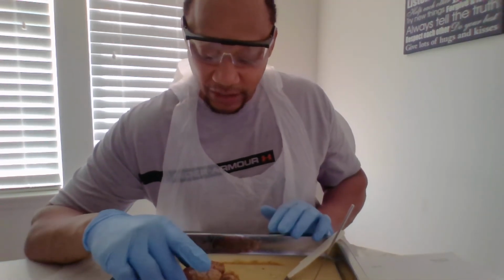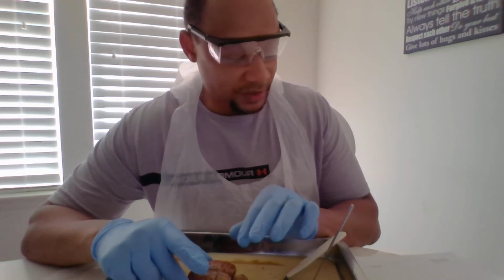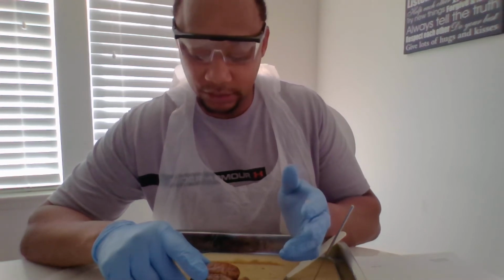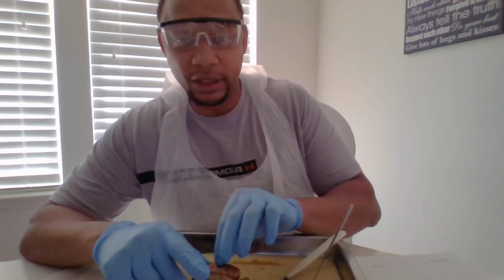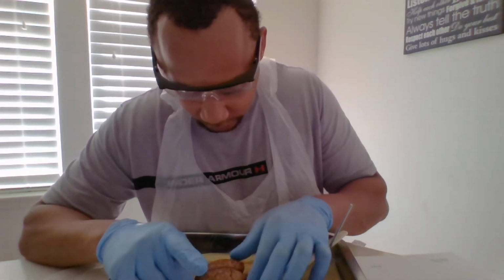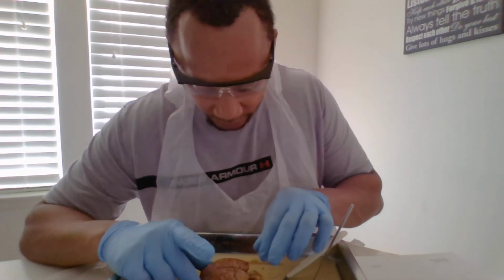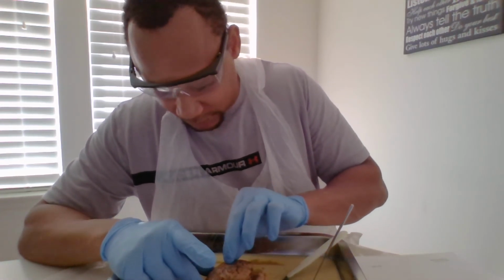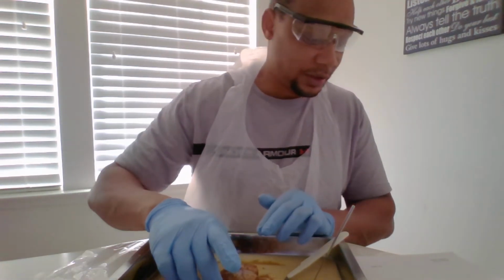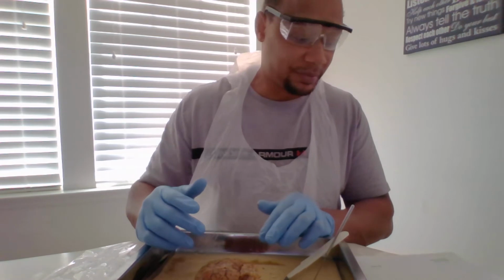Your meninges are actually right on top, and if you take off the arachnoid, it's like what comes from a spider. It's a shiny, webby type deal that's on top. Actually, some of mine came off. I've been trying to hurry up and do this because I had it a little bit too long, and it was getting old. But some of it's coming off right now. Then right below the arachnoid, you also have the pia mater.